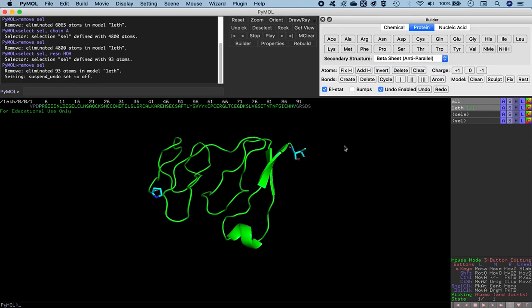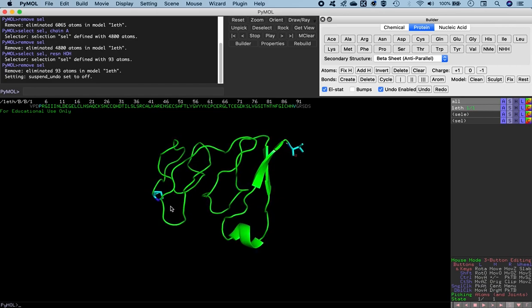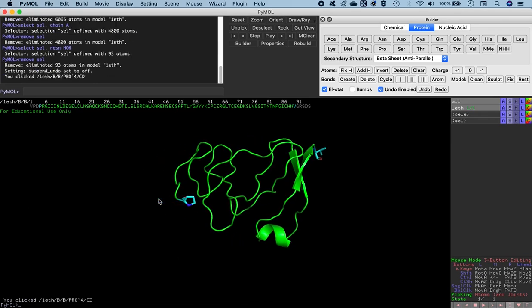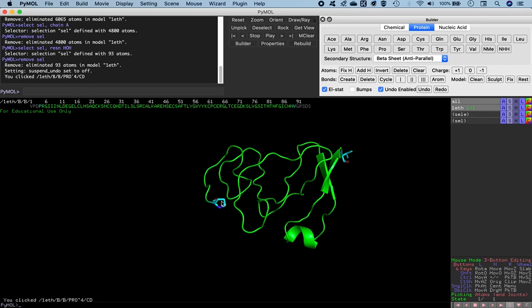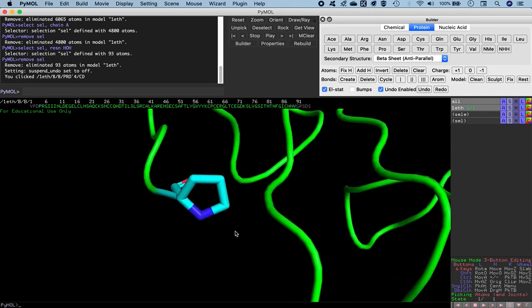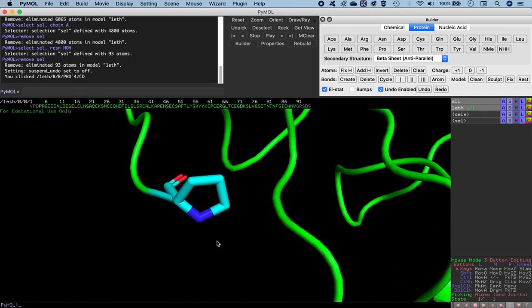So select this. And now we got to annotate the specific atoms on top of which we will be building all these residues. So let's go to the N terminal first. If you want to focus on this particular residue, which is proline out here, as you can see with the 5-membered ring that's being annotated, we click on the middle mouse button. So once you click on the middle mouse button, this brings into focus the proline residue in the N terminal. And then we drag along by clicking on the right mouse button in order to zoom into the structure. And you can clearly see now.